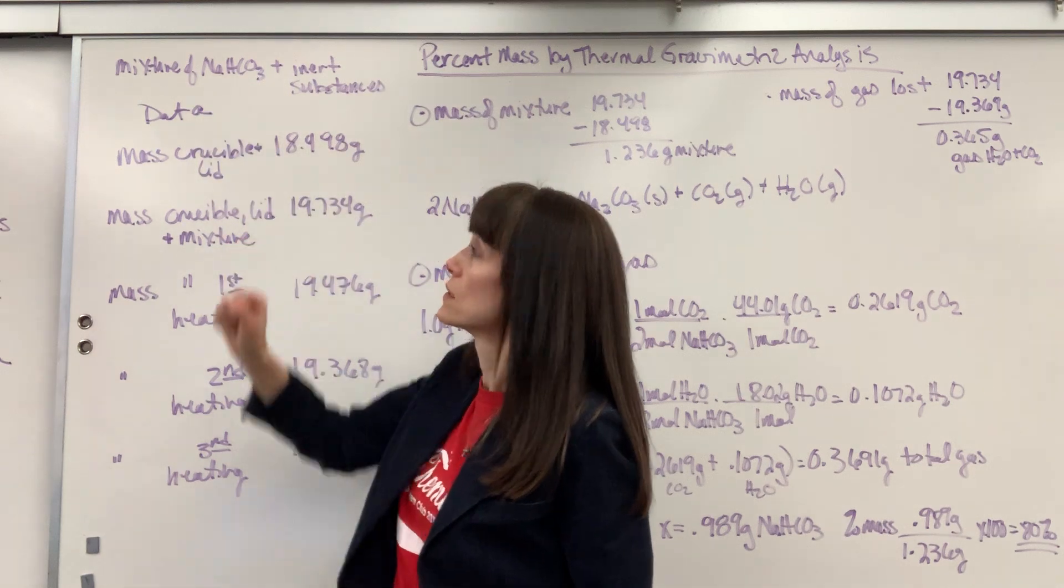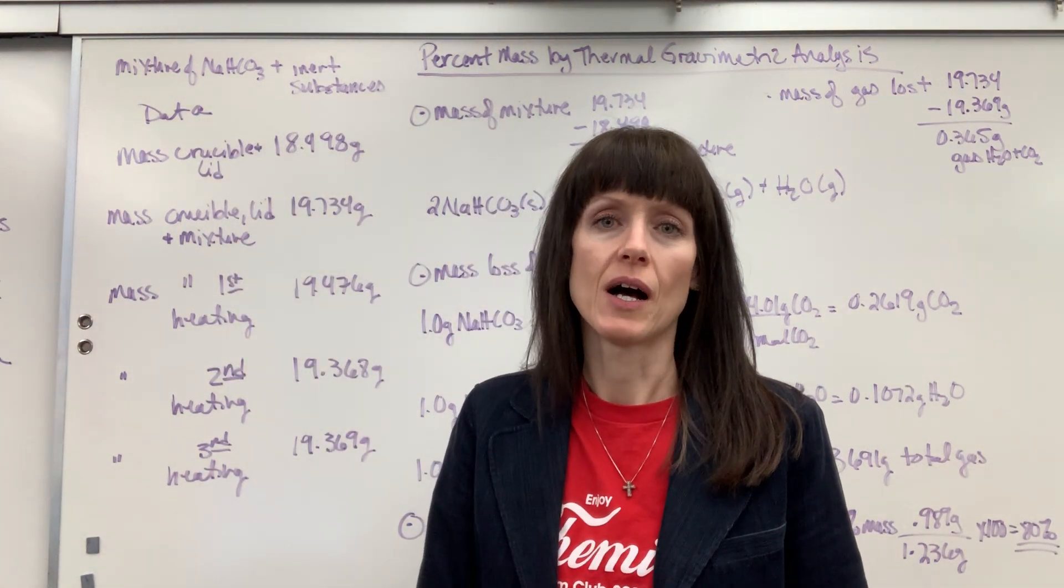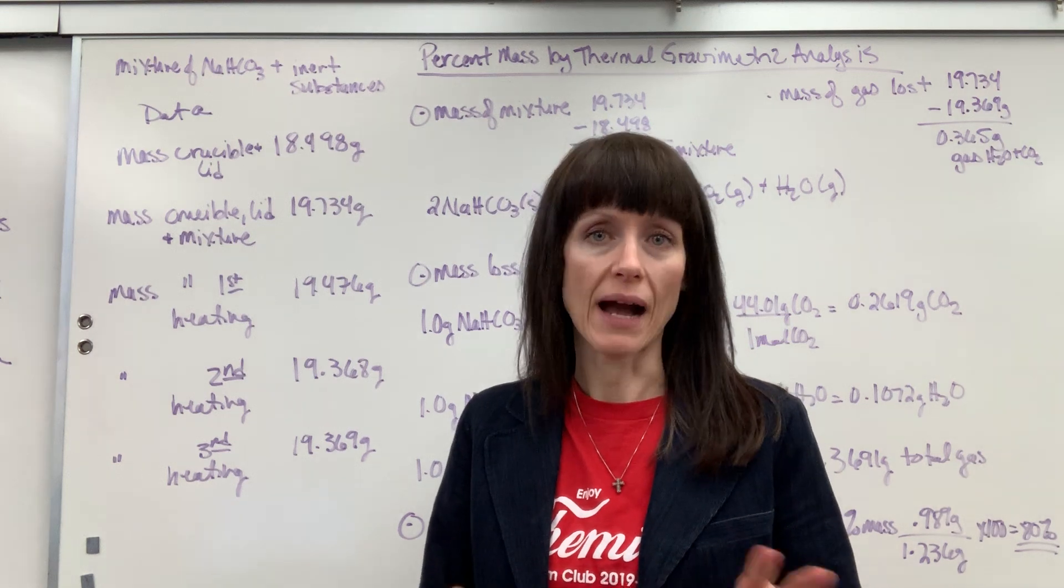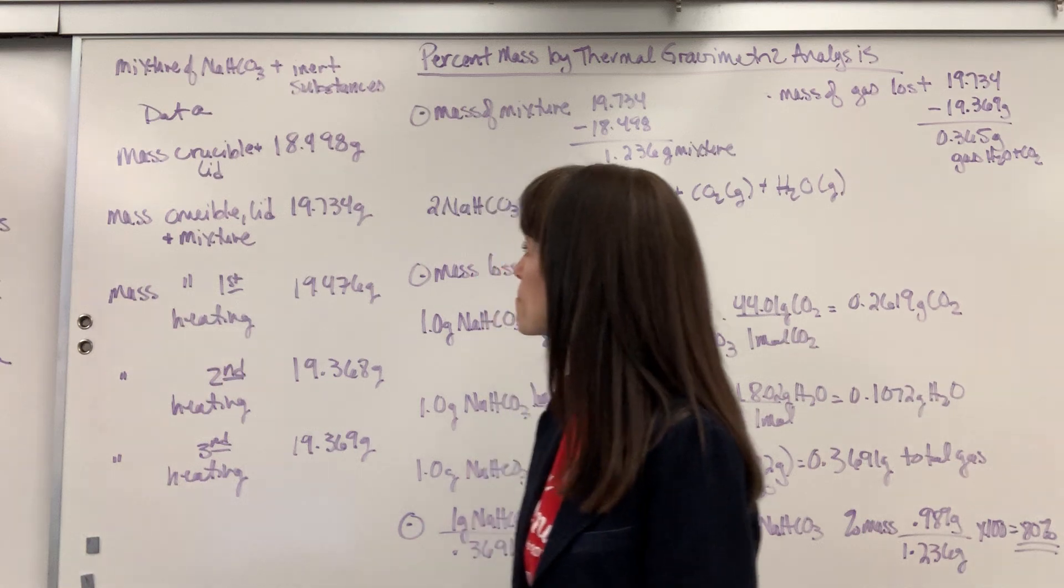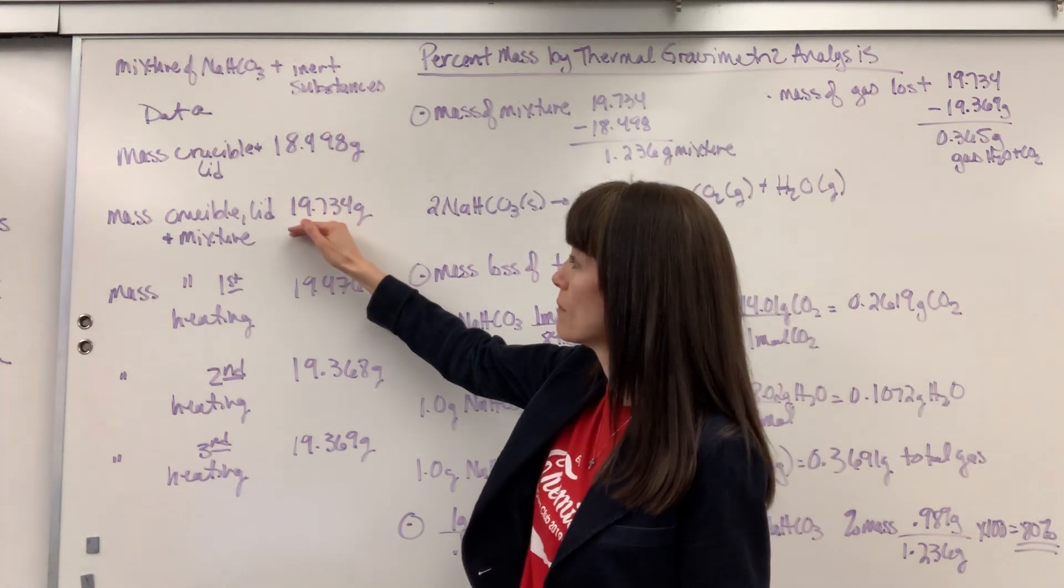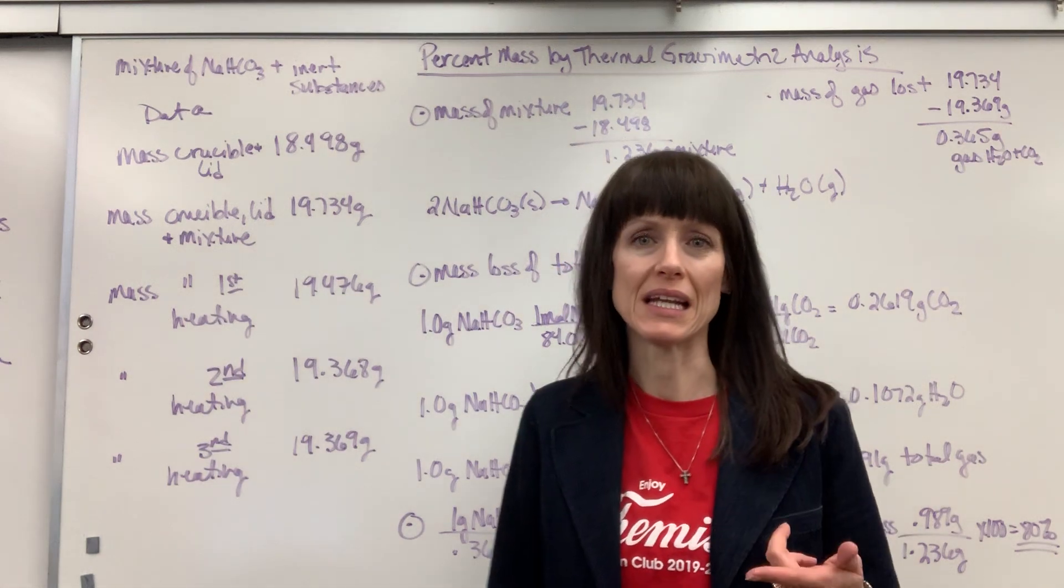I'm interested in the sodium bicarbonate and it's with some other inert substance that is not going to react or melt at the temperature that this will decompose. So we take the mass of the mixture with the crucible and lid, here we have it, and then you start heating it.